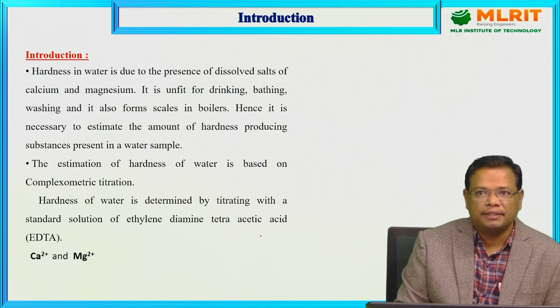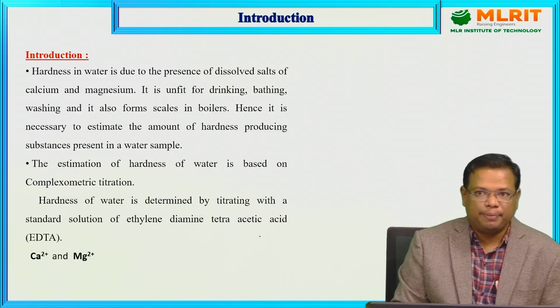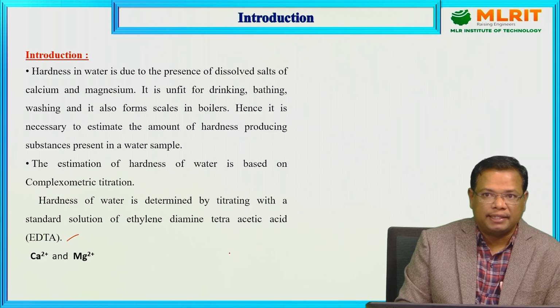So, before using the water, we have to check all these salts, how much concentration is present in the given water sample. This will be estimated by the EDTA method. What is EDTA? Ethylenediaminetetraacetic acid.